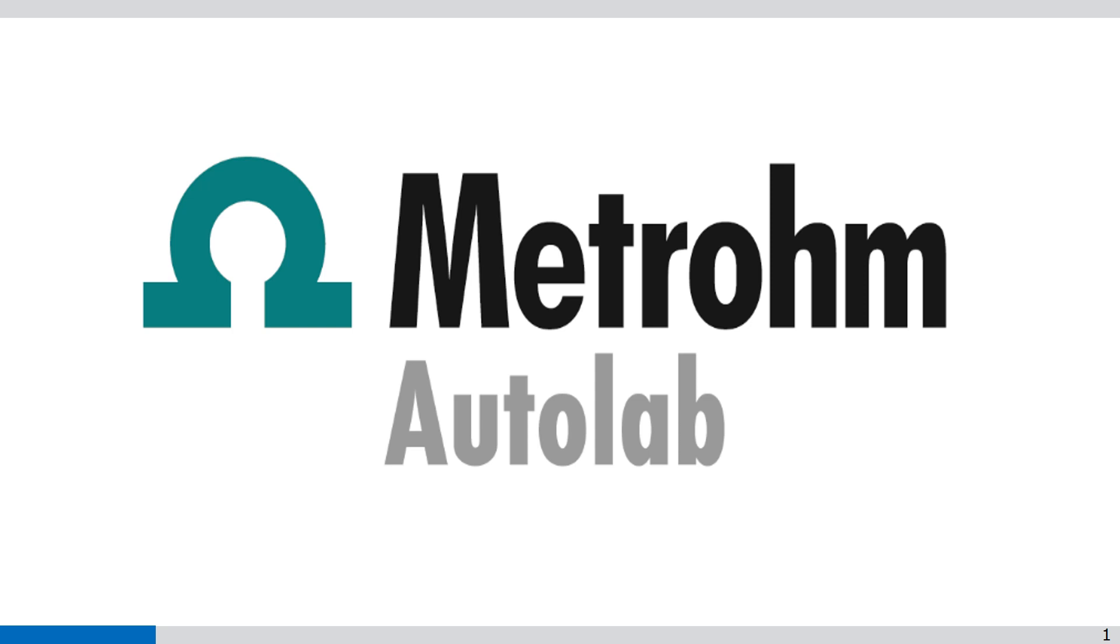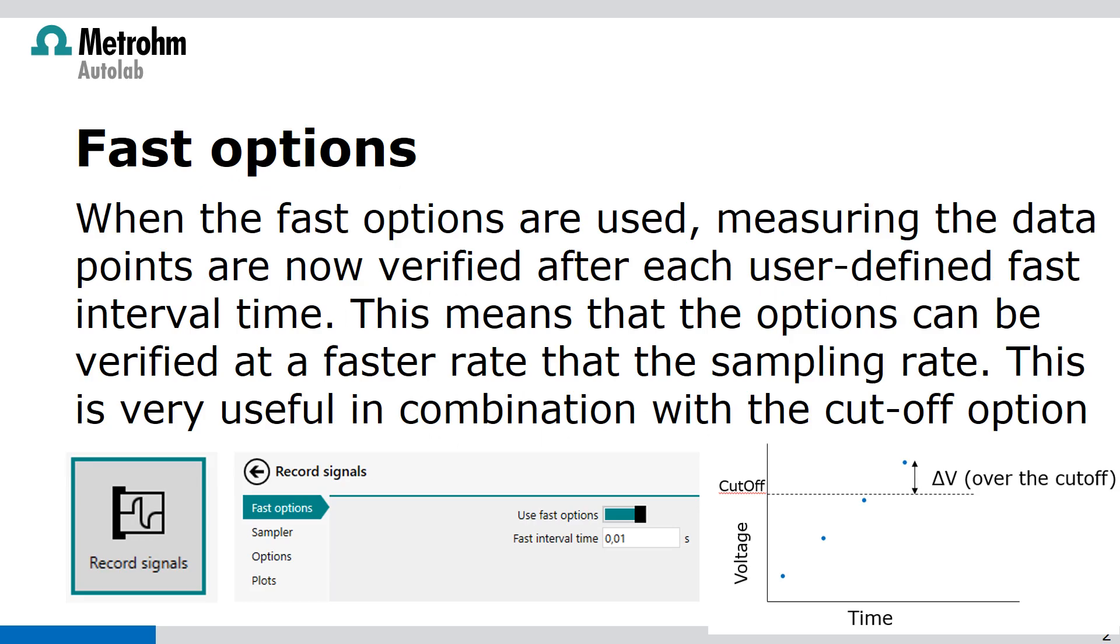Welcome to NOVA videos. When the fast options are used, the data points are now verified after each user-defined fast interval time. This means that the options can be verified at a faster rate than the sampling rate. This is very useful in combination with the cutoff options.